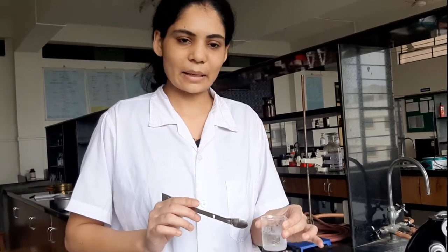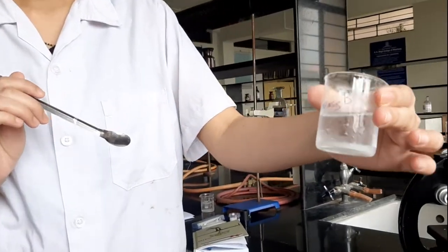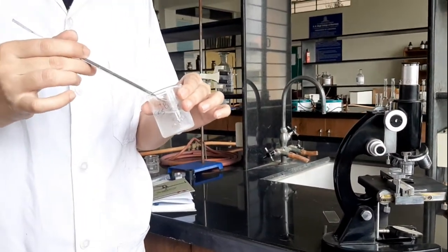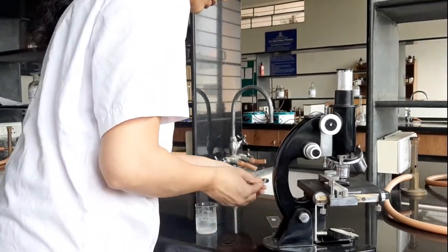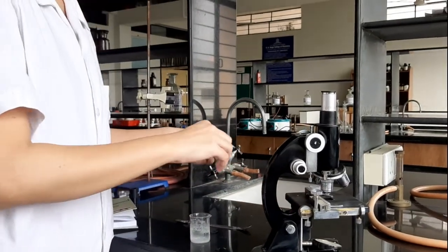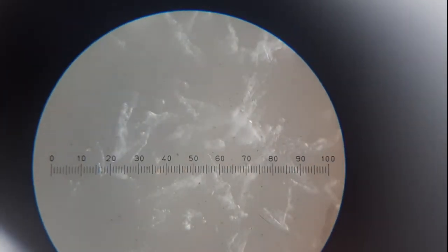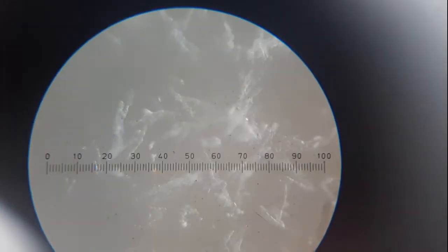Now this is the sample of our 40 minutes, and if you observe the crystal growth, it is just great. Now we will take out some sample and proceed with the determination of the particle size. We will place a cover slip and check the size. These are the crystals at the end of 40 minutes, and the average length was found to be 48 units of the eyepiece. Now we will proceed to the 50-minute sample.